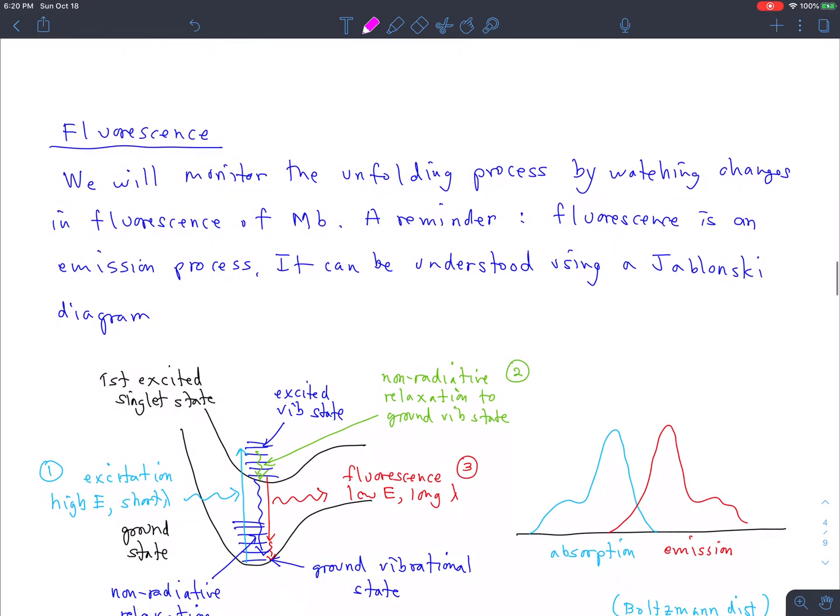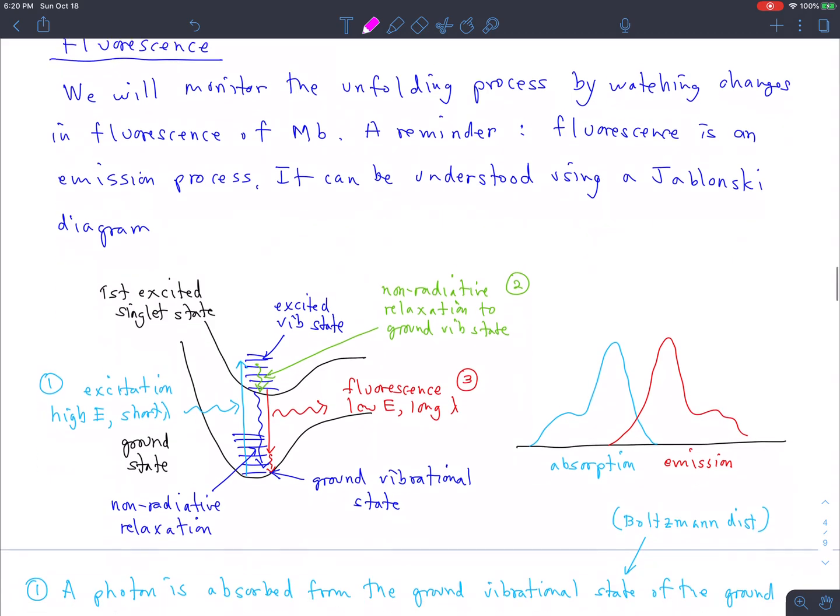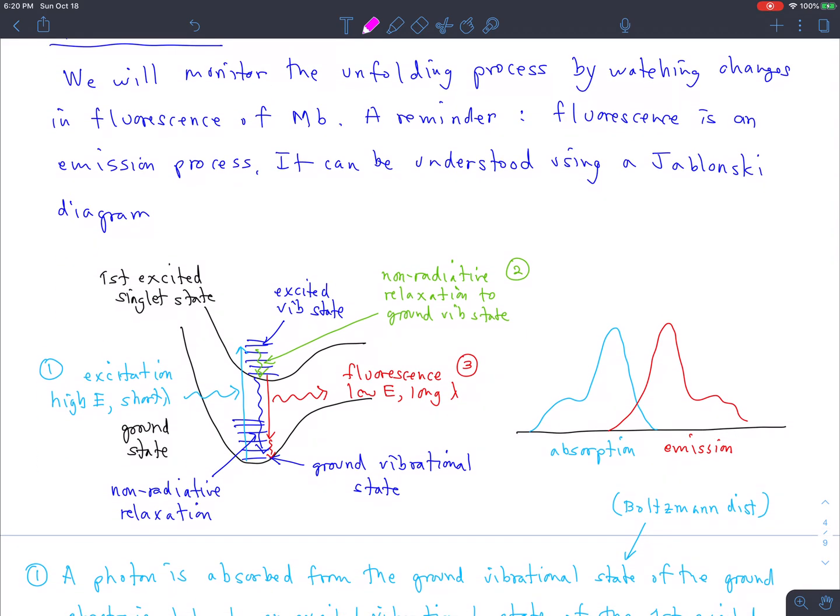Next thing I want to talk about is the actual fluorescence process itself. So I think everybody knows this kind of stuff already. This is a Jablonski diagram. Probably, I hope everybody has seen these things before. Here's the excited state energy surface. Here's the ground state energy surface. There's a manifold of vibrational states on both surfaces.